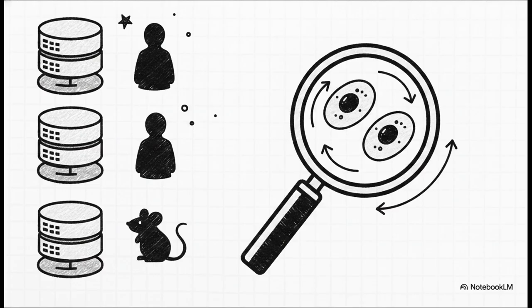Now, what's really interesting here is the quality control behind all this. To make sure the calculations are completely solid, the tool specifically relies only on tissues that have at least 2 biological replicates. Oh, and a quick pro tip, if you ever see a tissue prefixed with an E, like E14.5-placenta, that simply denotes an embryonic tissue from a specific time point. All the others without that E are isolated from adults.